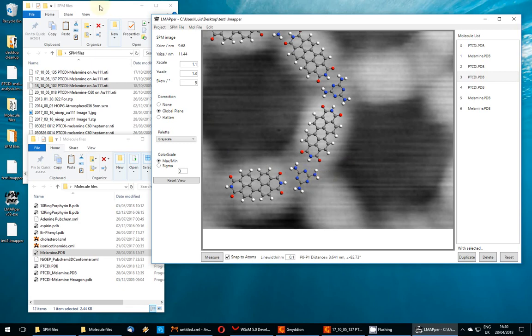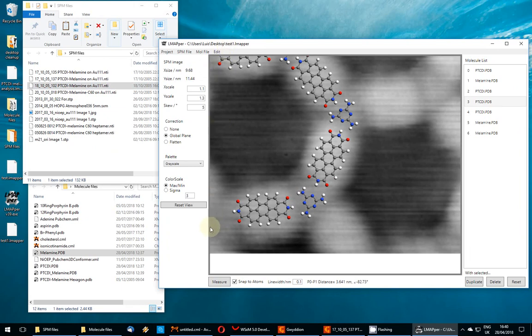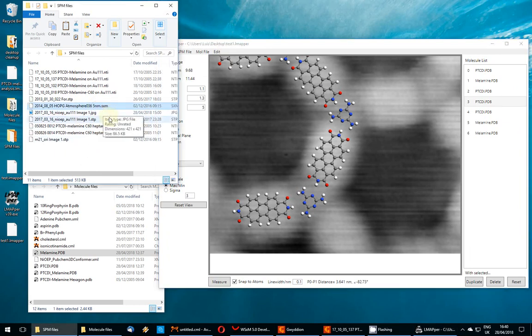I programmed some of the most commonly used ones that we use in our research lab. There's the SXM file from NanoNIS, and it also accepts STP files from WSXM.